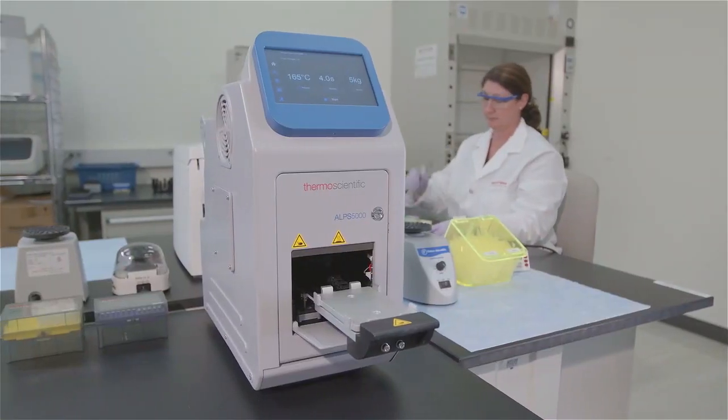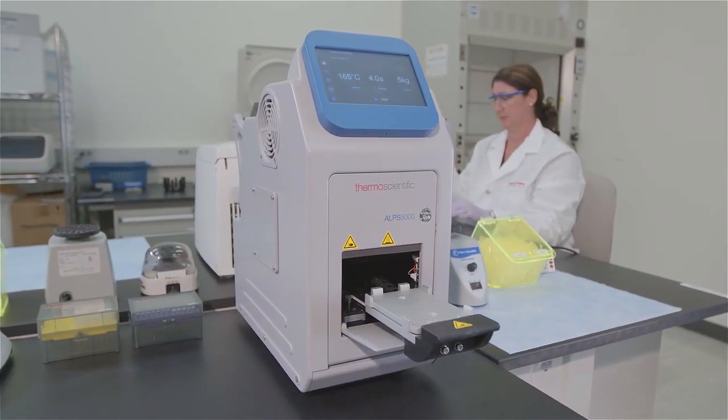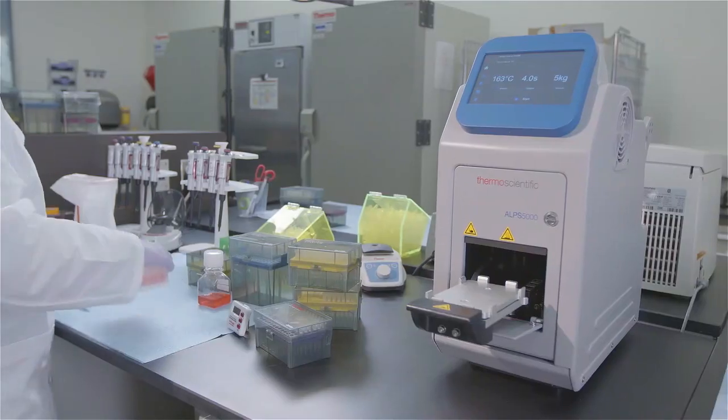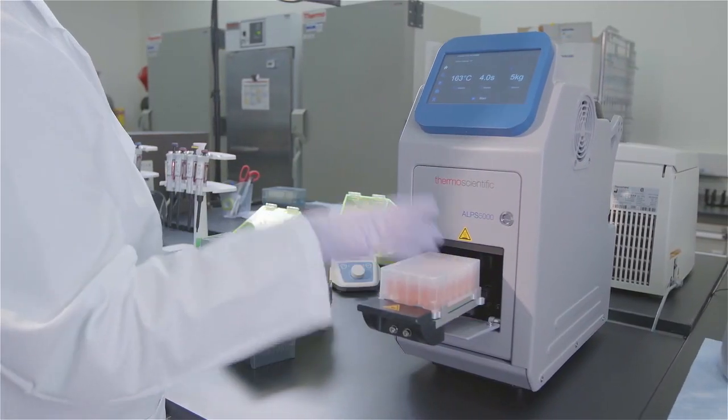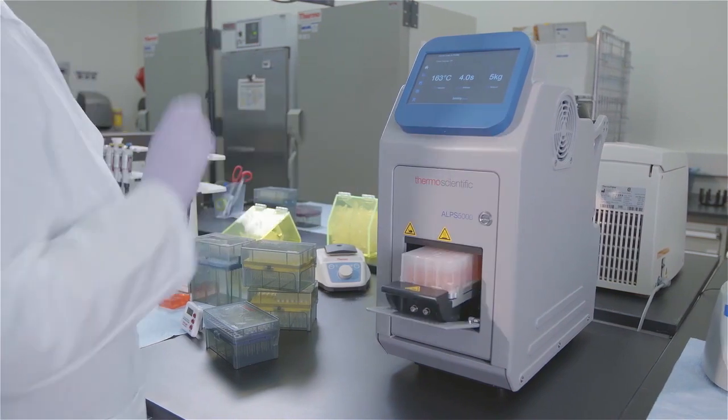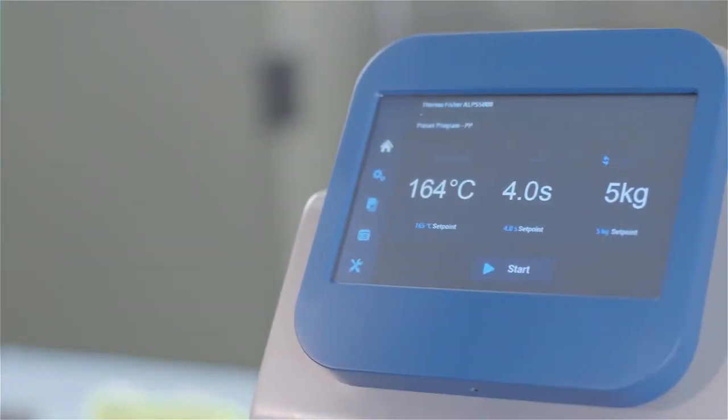This fully automated and integratable plate sealer requires no plate adapters and features tool-free loading and an eco mode. It uses half the energy of other models during operation and can help reduce energy use in the lab.